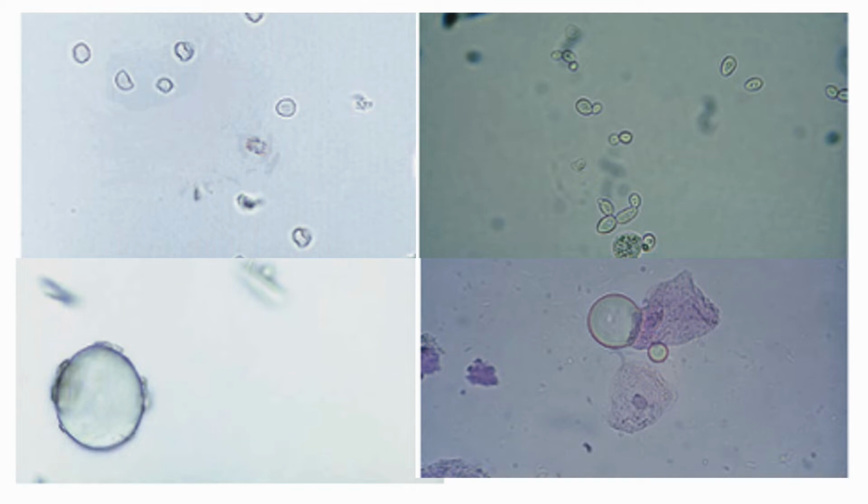You have the air bubble on the left lower quadrant. Notice the absence of formed elements in the area of focus. And on the right lower quadrant, we have a stained squamous epithelial cell adjacent to oil droplets. The oil droplets and the air bubbles are highly refractile when the fine adjustment is focused up and down, and they may also appear in a different plane than the other sediment constituents.